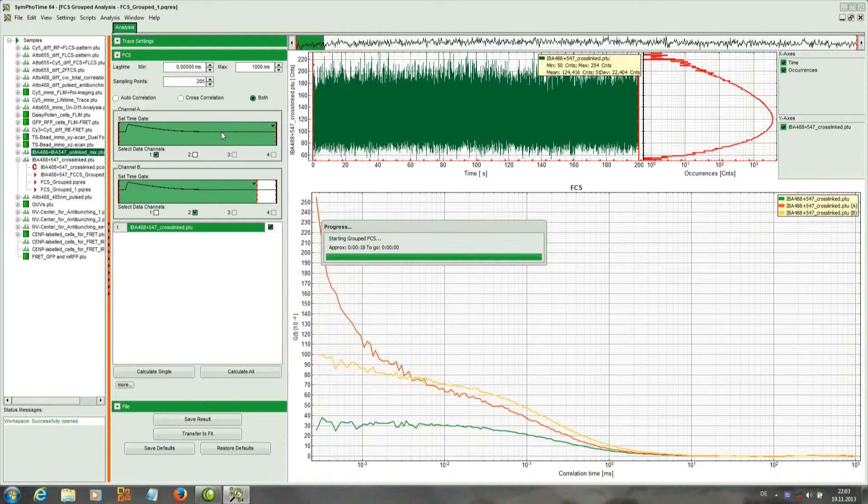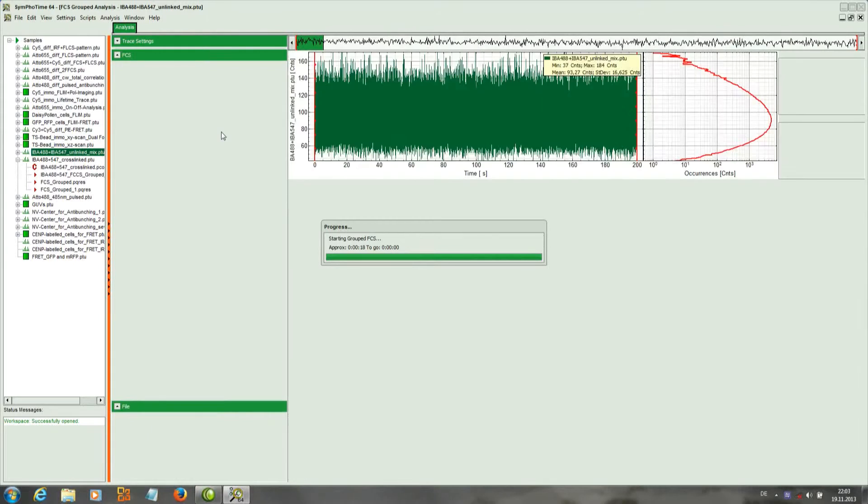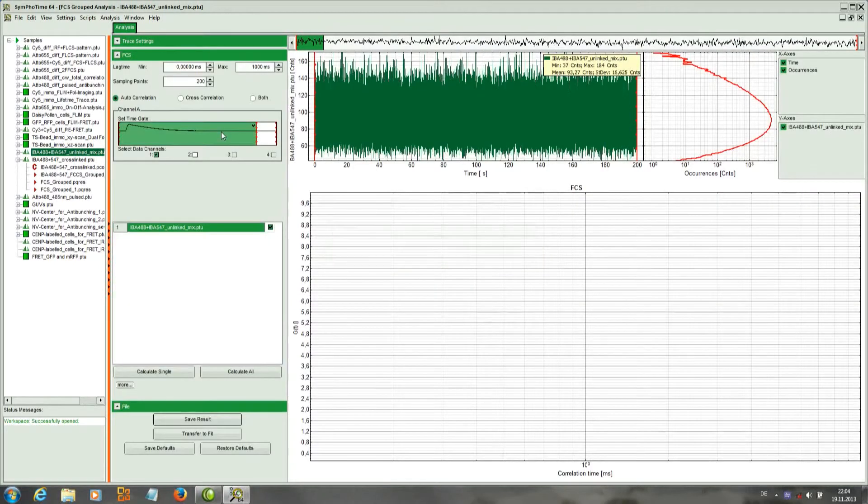As before, a window opens which contains the same areas.